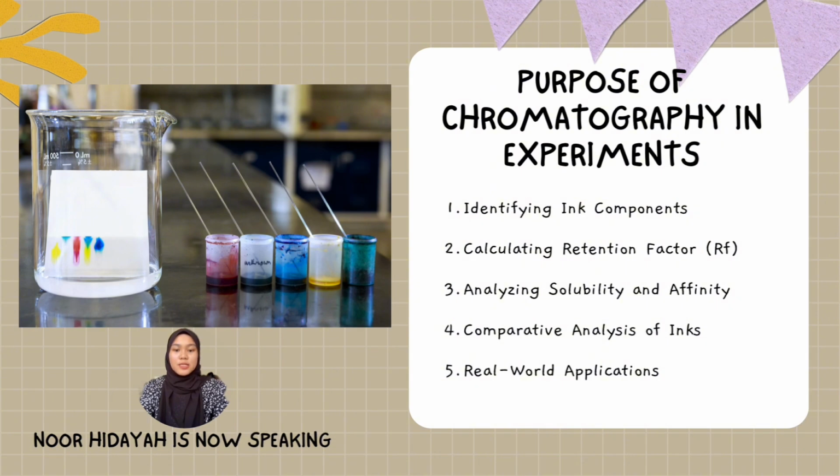Third, we have analyzing solubility and affinity. We can understand the interactions of inks components with the stationary phase, which is papers, and the mobile phase, which is solvents, based on the difference in the solubility and polarity. And fourth, we have comparative analysis of inks. By compare inks from the different gel pens to identify similarity or differences in their pigment compositions. And lastly, we have real-world applications. We can apply these findings to the practical context, such as forensics analysis or quality control in the ink productions.